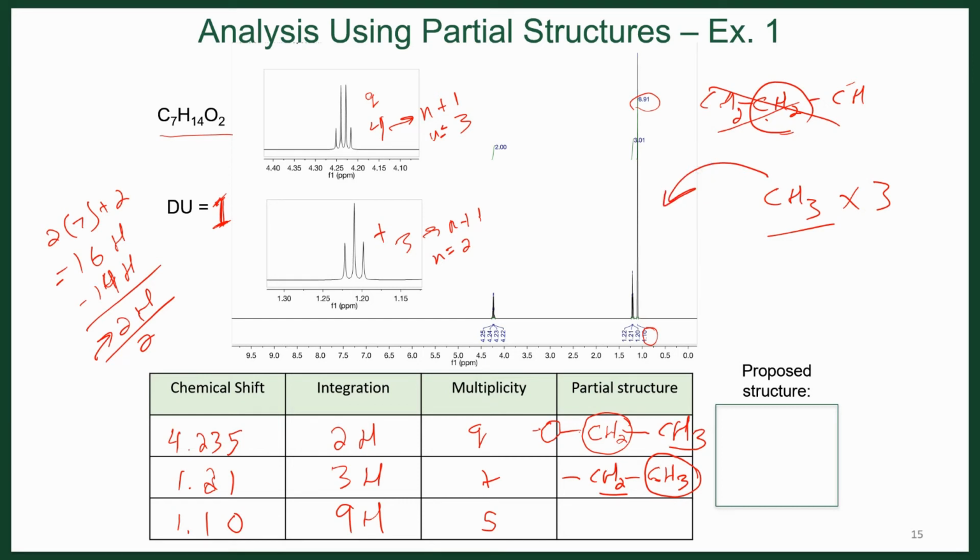And one of the ways that you get this is by having a T-butyl group. That is, you have 3 methyl groups that are directly attached to a quaternary carbon. And these 3 methyl groups appear as the same on the NMR experiment because there's free rotation about this particular bond here, and so they can rotate around and they all look the same. So it's likely what we have here is 3 methyl groups attached to a carbon, and we're observing this signal here.